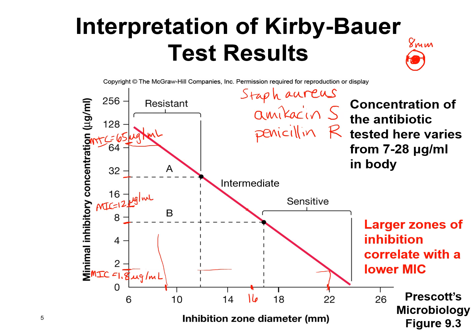Well, that is in between, where you could be above that, depending on the dose of drug, but because you do have a range between 7 and 28, you could be at the low end. And you may not get above 12 if you're down here around 7. So that one we would list, maybe we're looking at tetracycline or something, and so that antibiotic will be listed as intermediate, meaning that it might work, it might not.